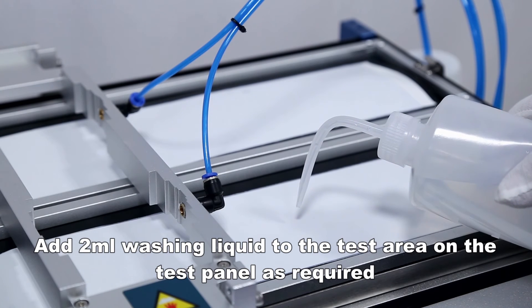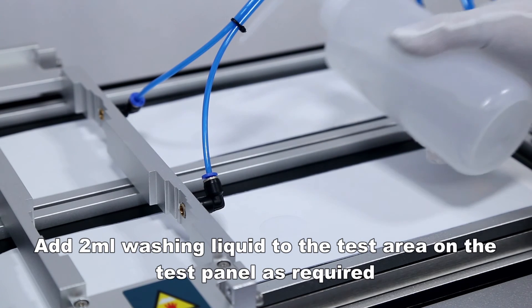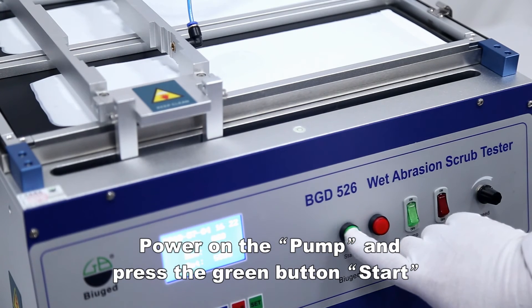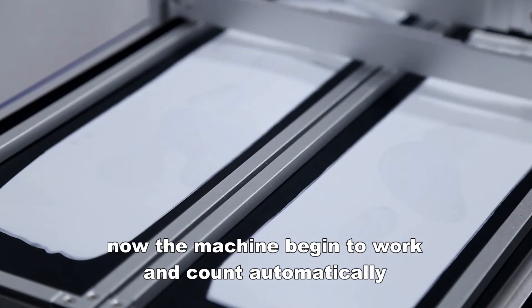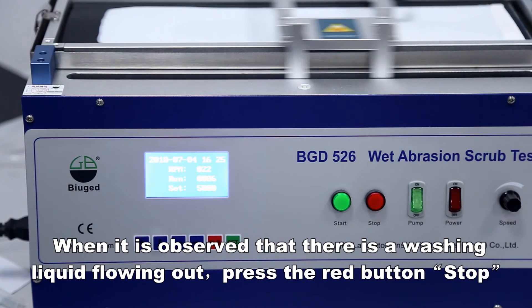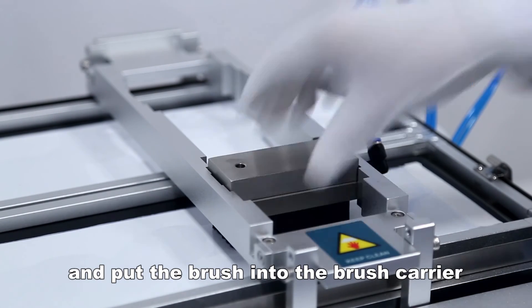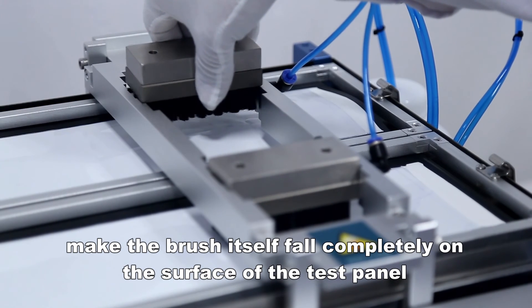Add 2 milliliters of washing liquid to the test area on the test panel as required. Power on the pump and press the green button to start. When washing liquid is observed flowing out, press the red button to stop, then put the brush into the brush carrier and make the brush fall completely on the surface of the test panel.